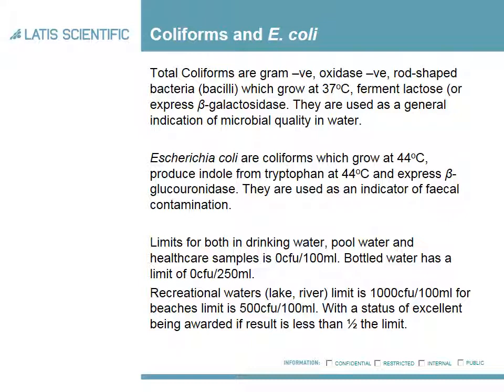Bottled water has a slightly different limit of 0 per 250 mls, but again, you shouldn't find them present in bottled water, and that's not just for 12 hours after bottling, that's at any point during the lifetime of it until it's consumed. When you're talking about recreational waters like lakes and rivers, you have a limit of 1,000 CFU, and beaches have a limit of 500 CFU. And the status of excellent is awarded if you get less than half that result.